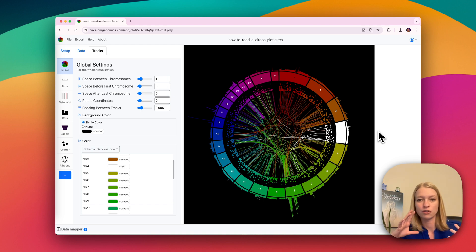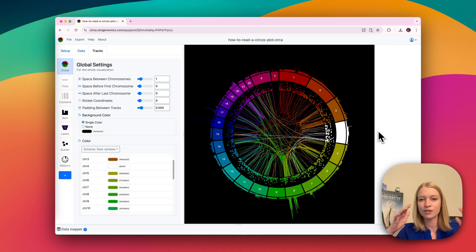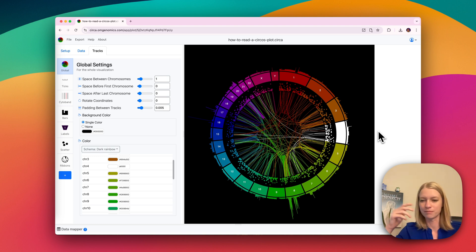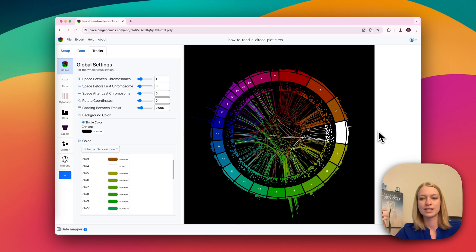And you don't have to only fit one genome in here, you could fit multiple, line them up and mirror them and show synteny.